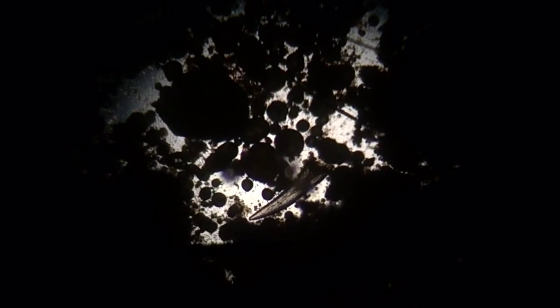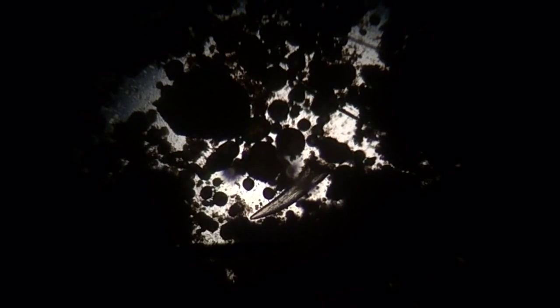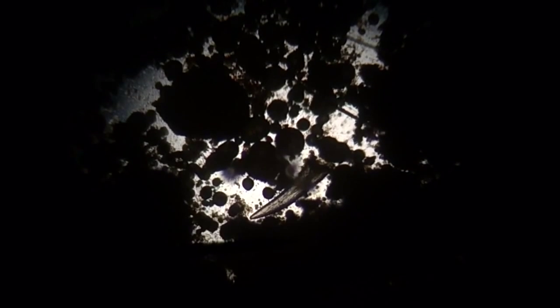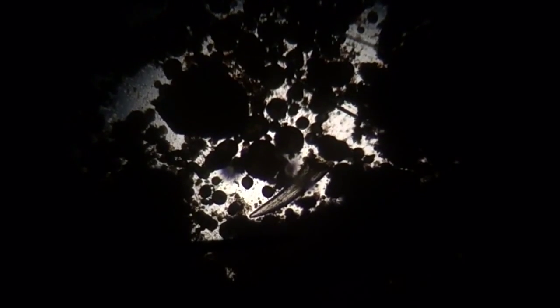Same baby rattlesnake fecal, there's another tooth there that was shed. Most snakes actually shed teeth pretty regularly. And there's another one there, so we're going to finish up this fecal look for more parasites.